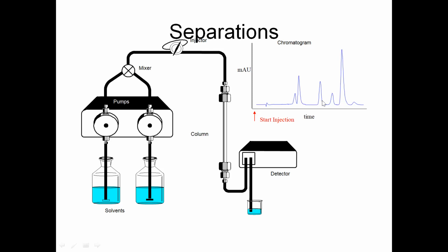That is 4 minutes, that is 6 minutes, it is 8 minutes, and say it is 15 minutes. Say it is 20 minutes. So this compound is having the highest retention. Highest retention means its polarity is matching with the polarity of the column. If the column is C18, this is a non-polar compound. If the column is silica, this is a polar compound.